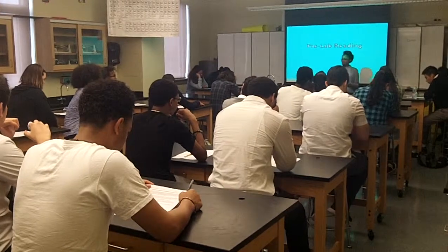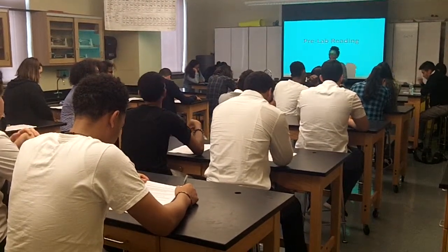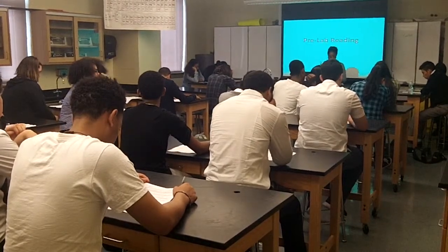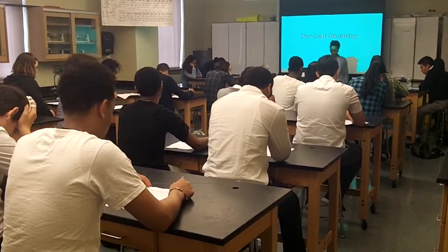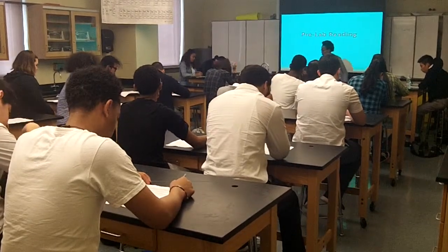indigestion quicker. So, for today's lab, you need to be thinking about the rate of the reaction that's involved when we use antacid tablets. Can somebody please read for me the purpose of today's lab? Go ahead, Hector. You are going to test a variable of your choice to see its effect on the rate of the chemical reaction. Absolutely.